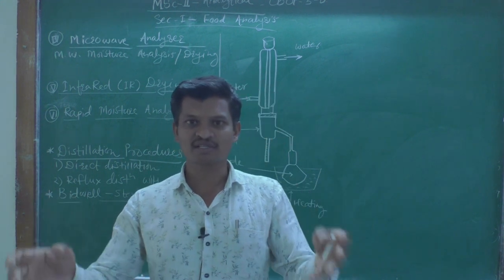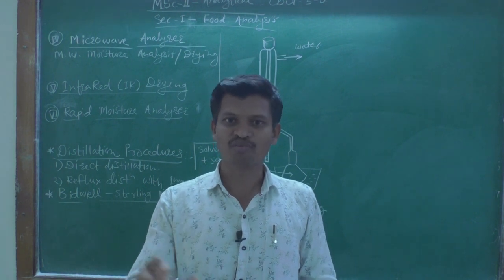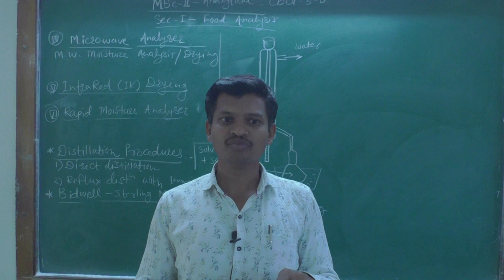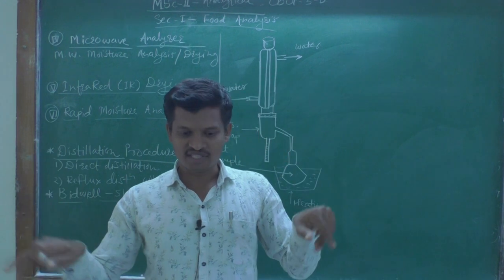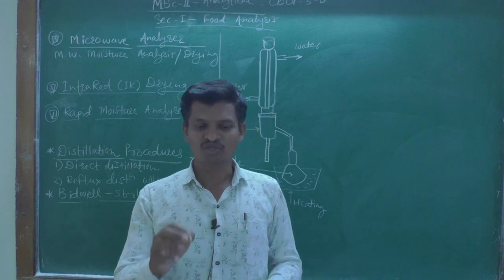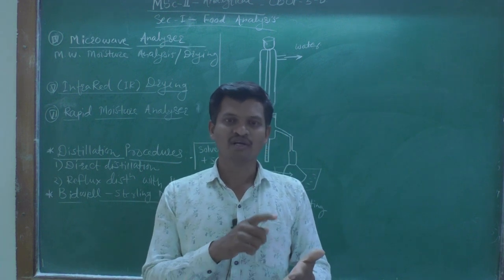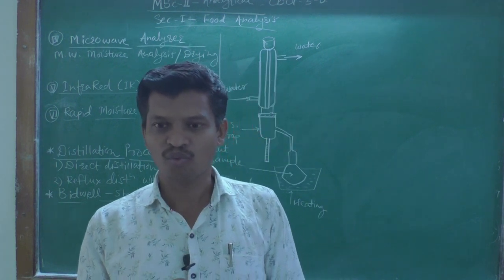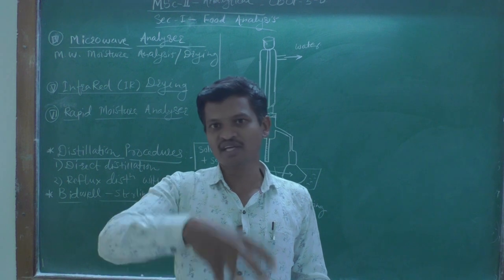The digital weighing balance is there in that machine, and on that aluminium pan or on a filter paper, we are keeping our sample. Under controlled conditions, where there is no contact between our sample and atmospheric moisture, the system is automated in such a way that, as there is an automatic weighing machine, at the time of keeping our sample we can write down the weight of our sample.